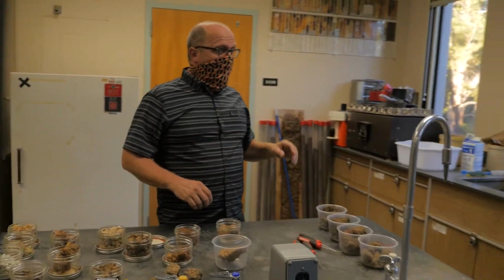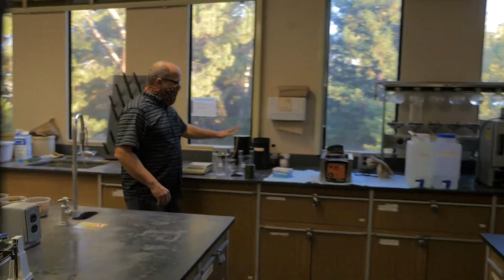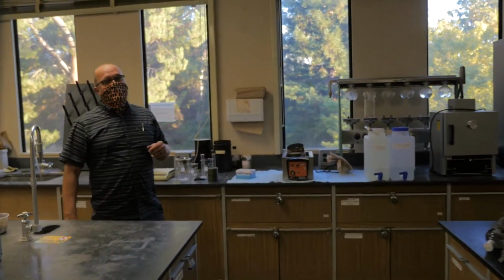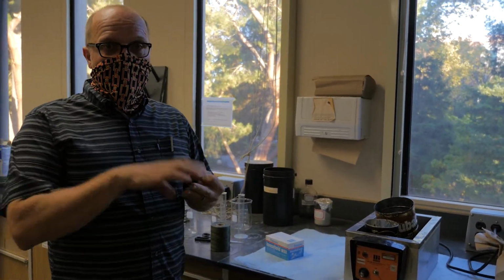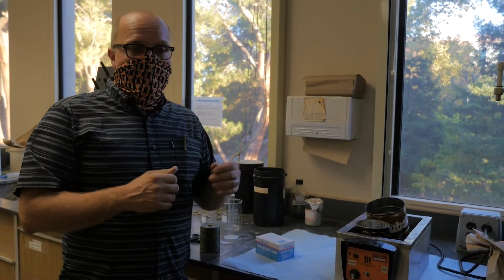So what we're going to work on is we're going to use some basic equipment here. We're going to use some beakers. We've got a hot bath here with some paraffin wax, some string, and with those things we're going to be able to show you some basic, really important ideas about porosity, particle density, and bulk density through some pretty traditional methods. So let's get to it.